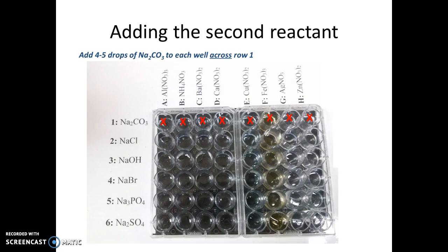I'm going to repeat this for each row on the table, continuing for rows two, three, four, five, and six, until I've added my second reactant to every well on the plate.